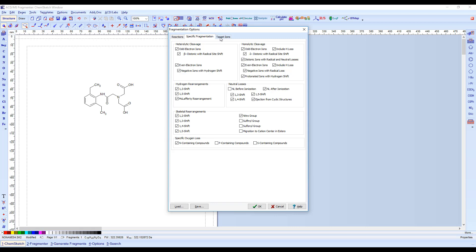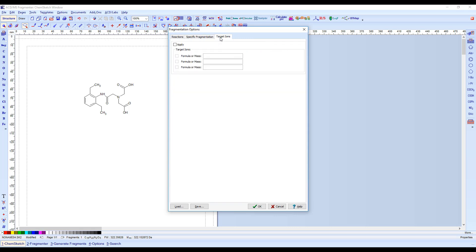The Target Ions tab allows you to input specific ions by mass or molecular formula. The software will then target those ions.